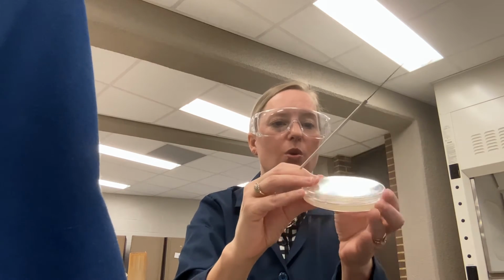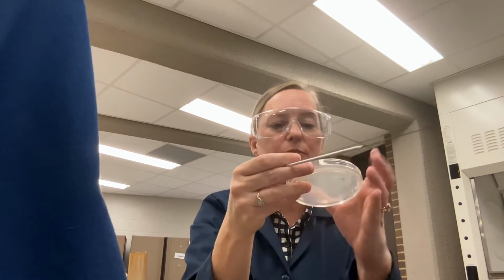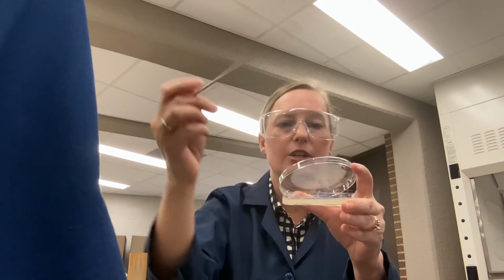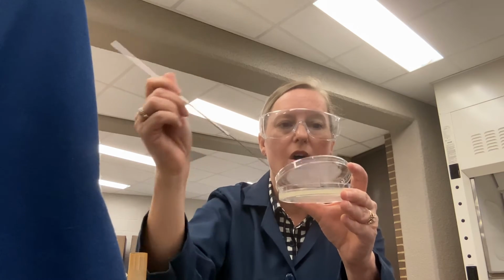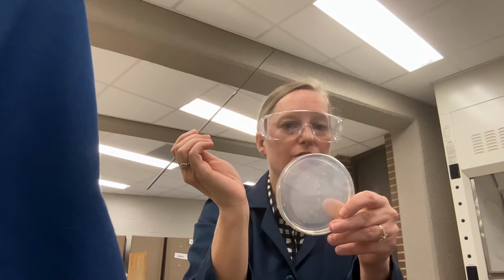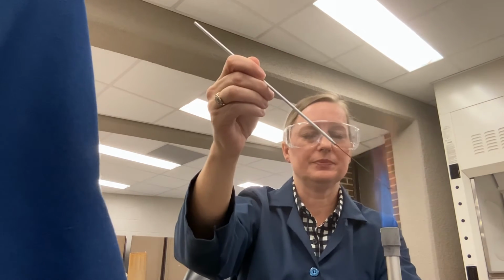So the loop is cool. So again, you're going to be doing this flat on the table, but for you to be able to see, I'm going to have to hold it up. So now I'm going to drag from 2 to 3. So I'm just rotating the plate slightly. I'm going to take my loop, and I'm going to drag 3 or 4 lines. So 1, 2, 3, all the way from edge to edge, from zones 2 to 3. Reflame the loop, which I'll let you see.